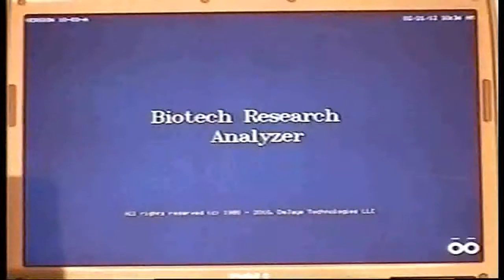Let's go back into the program again and we'll take a look at the calibration feature. There's our blue screen. Again, we forget about our mouse and we're keyboard controlled from here on in.